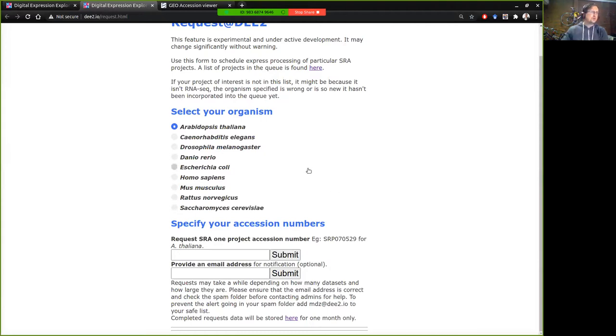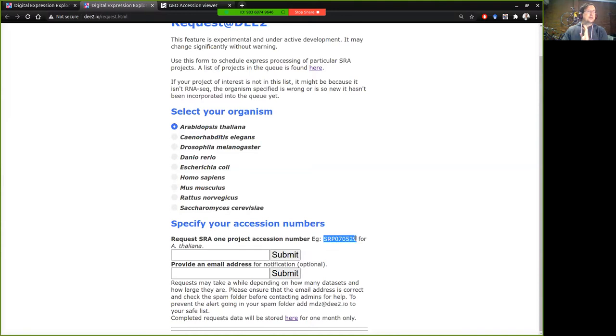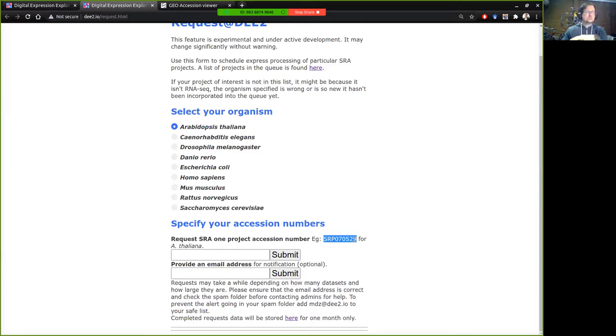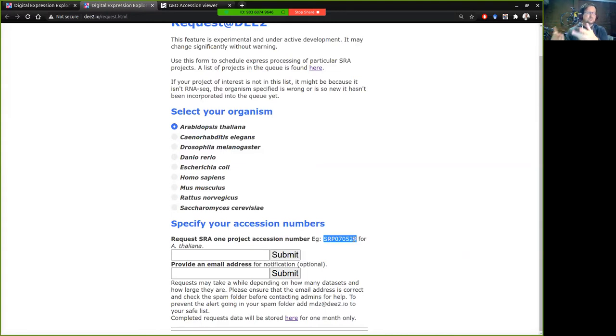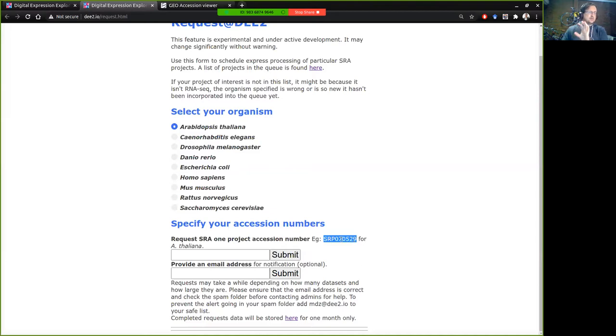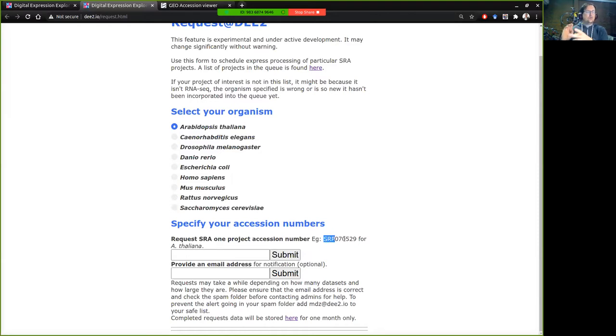So you've got your organism of interest here and you can put in the accession number that you want to process and you'll notice that these are SRP numbers. So these are SRA project numbers and that's a bit different to the original page which can accept different types of identifiers like GeoSeries runs and experiments. This one only accepts SRA project numbers and they tend to begin with SRP, ERP or DRP.